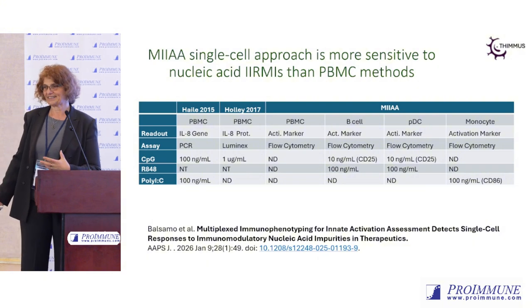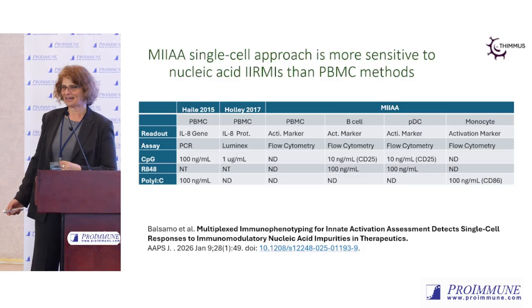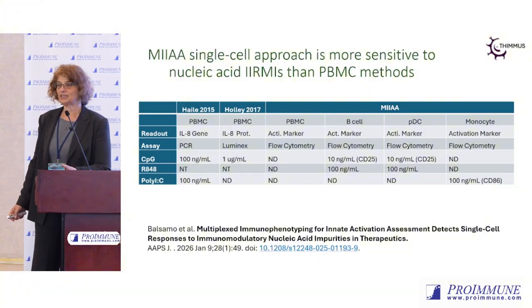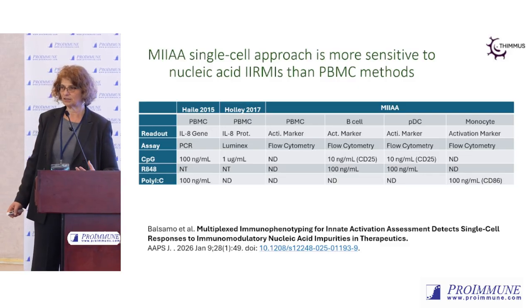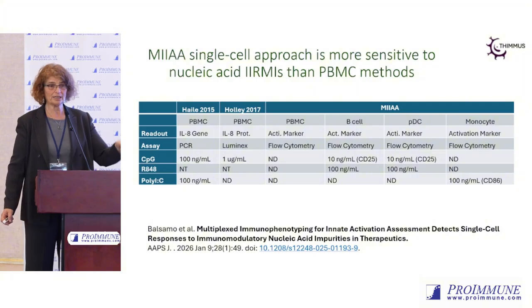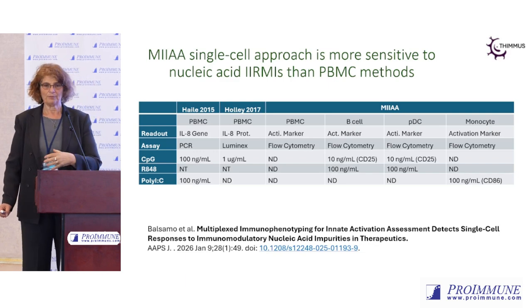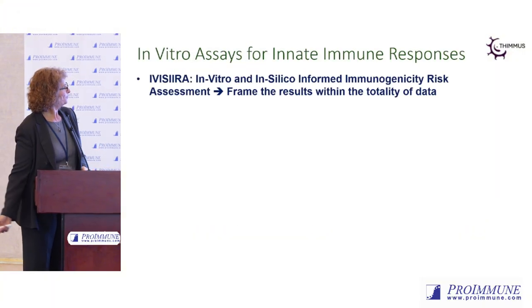So, is this an assay that you would want to run on all your samples? Absolutely not. But is it an assay that might be helpful if you're trying to investigate an issue, if you're trying to understand, or if you have a specific concern? For example, we were concerned for oligonucleotides, is there a TLR9 activation of plasmacytoid dendritic cells, which might not lead to immunogenicity, but could lead to an increase, for example, in interferon, making patients feel kind of lousy. So it is an assay that you can do to investigate products more thoroughly.